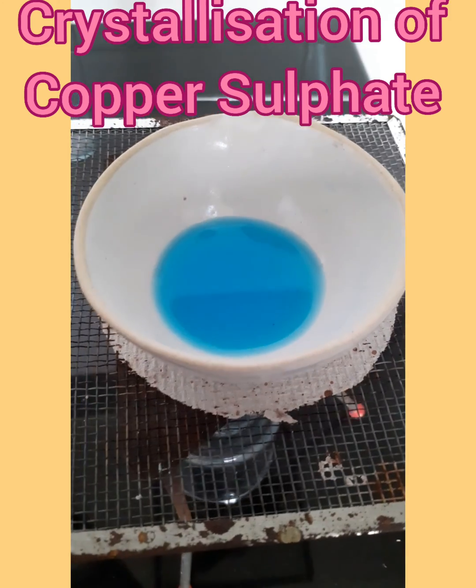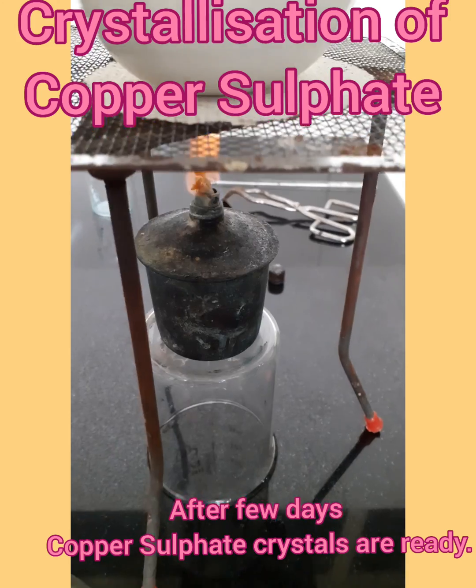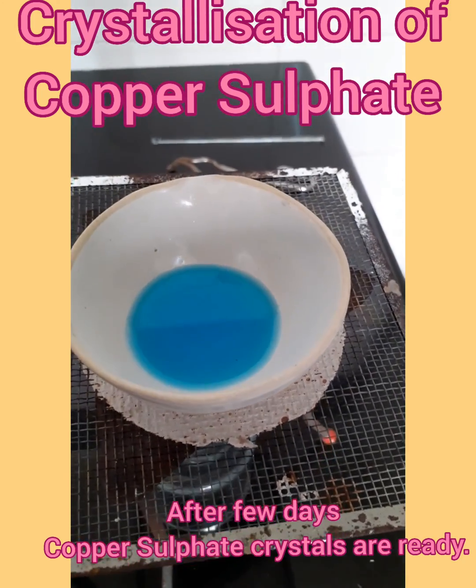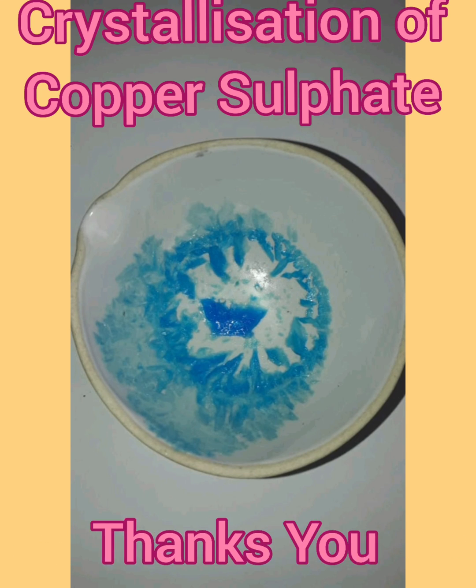After 5 minutes of heating, we will leave it for 2-3 days undisturbed so that the crystals of copper sulphate can be formed. Blue colored copper sulphate crystals are ready. Thank you!